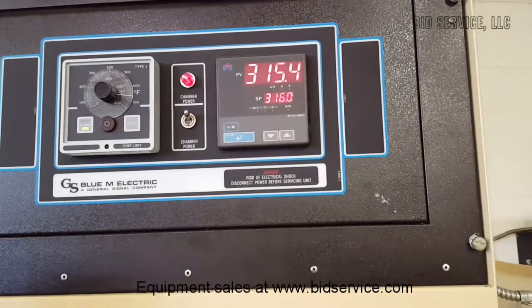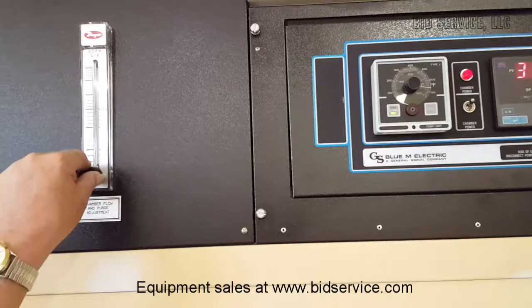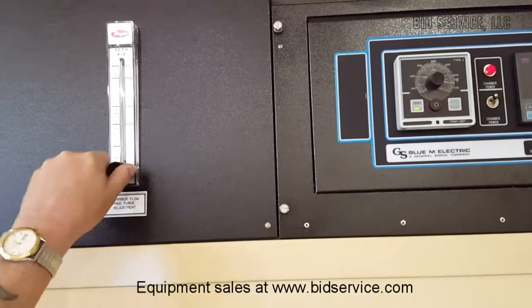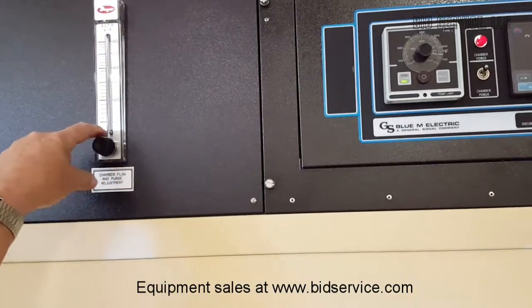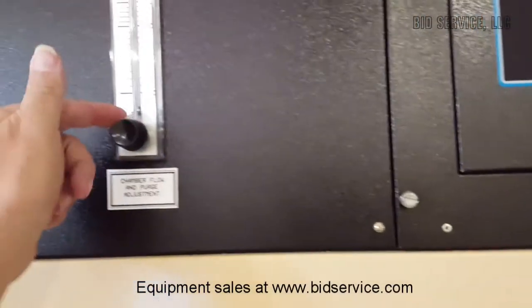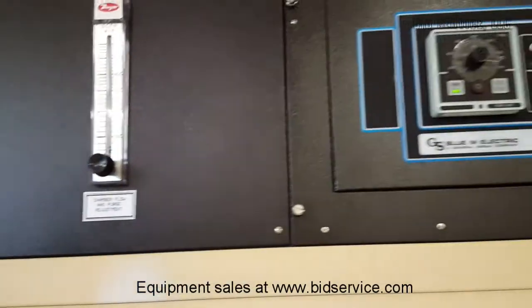Another thing I didn't point out before — over here — is your chamber flow and purge adjustment. All you do is have your input in the back, which I'll show you, and then you can increase it. You can see your flow rate here with the ball valve, if this is something that you need to use.